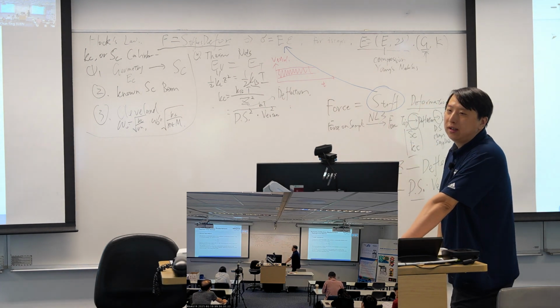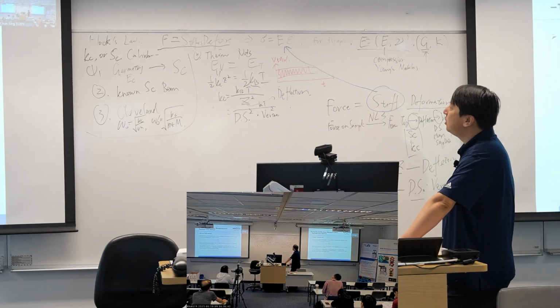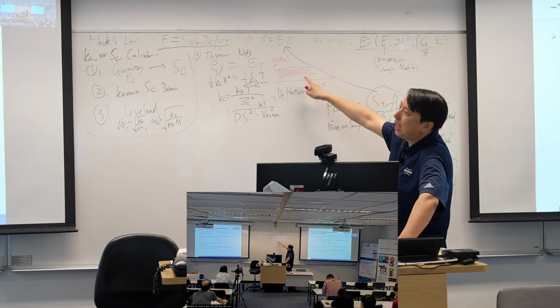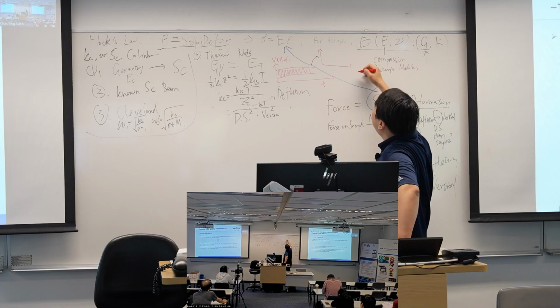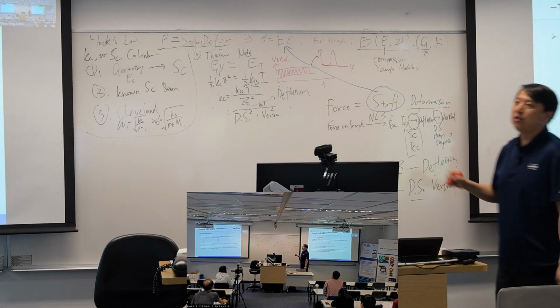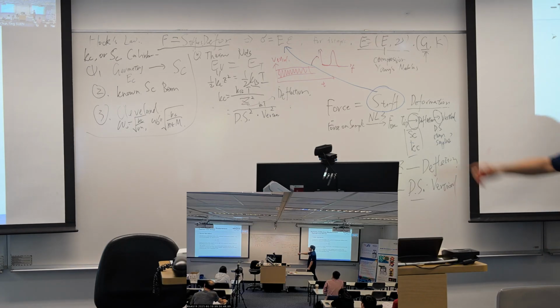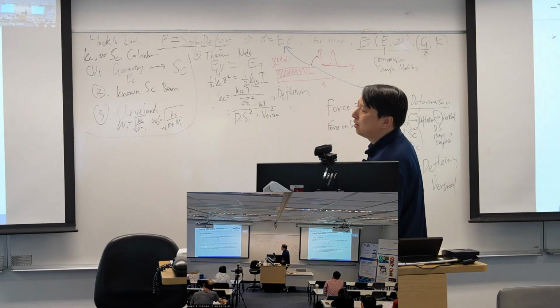So that's the main idea. Of course, in the instrument, they usually make a little change. Once we calibrate this time domain information, they do a Fourier transformation into the frequency domain, and usually you will see this kind of curve. But that's just the mathematical game.